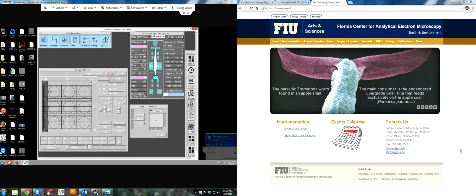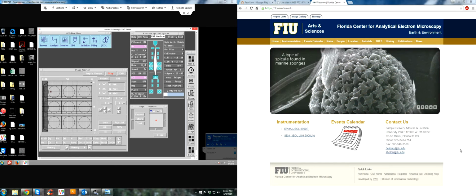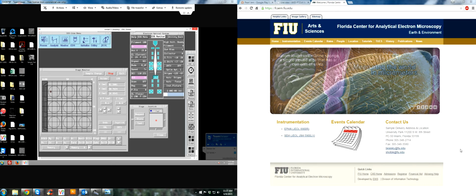Normally, here at FCAM, we do the standardization for you, but on occasion you might be looking at an unusual mineral sample, which maybe you'll need an unusual standard for, or maybe we're not available to do the standardization prior to your quantitative analysis, so you might have to do this on your own. So this video serves just to remind you and show you how to do standardization procedures.